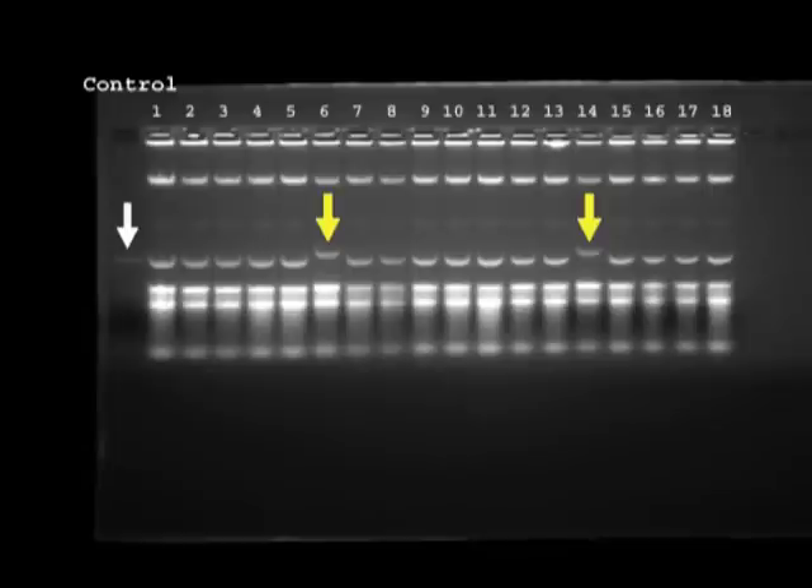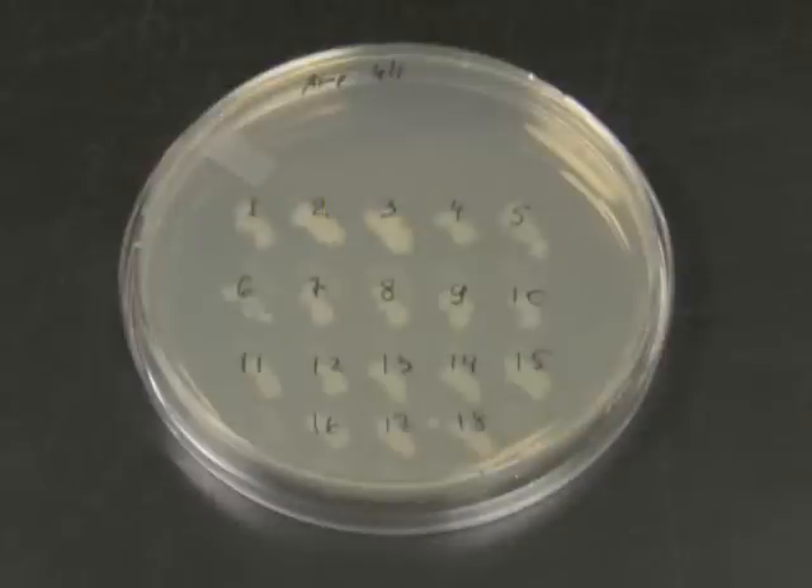Let's look at the picture of this gel. Since we run the whole cell lysates here, we can see three types of nucleic acids. RNA is that big smear at the bottom. At the very top is genomic DNA. And the plasmids we are looking for are in the middle. In the control lane, you can see how the vector would run if it didn't have an insert. Out of the 18 colonies that we are screening here, only plasmids from colonies 6 and 14 run higher than the control, which means they should have the insert that we are trying to introduce. On the next day, we can go back to the replica plate and start the mini prep cultures with clones 6 and 14.